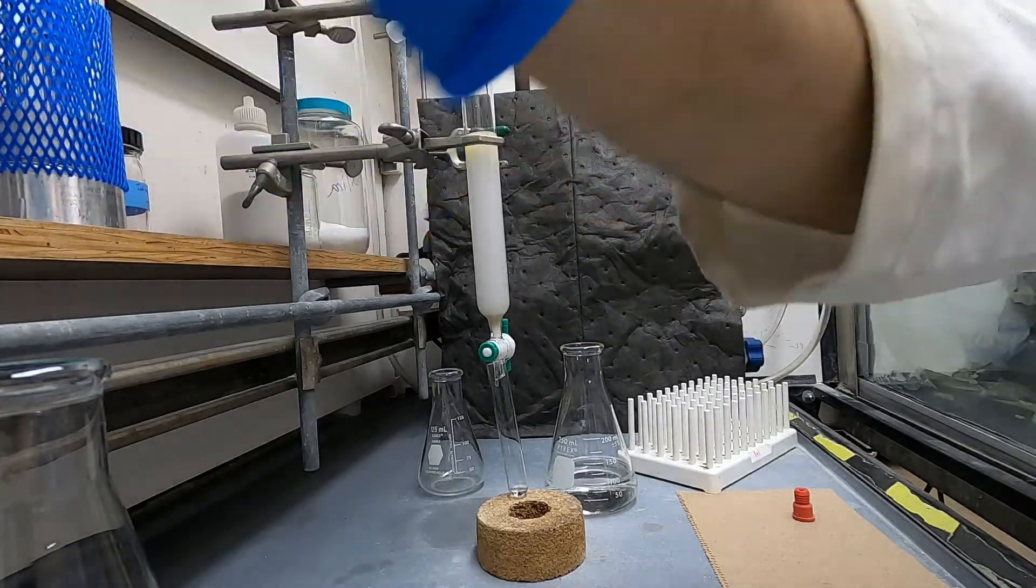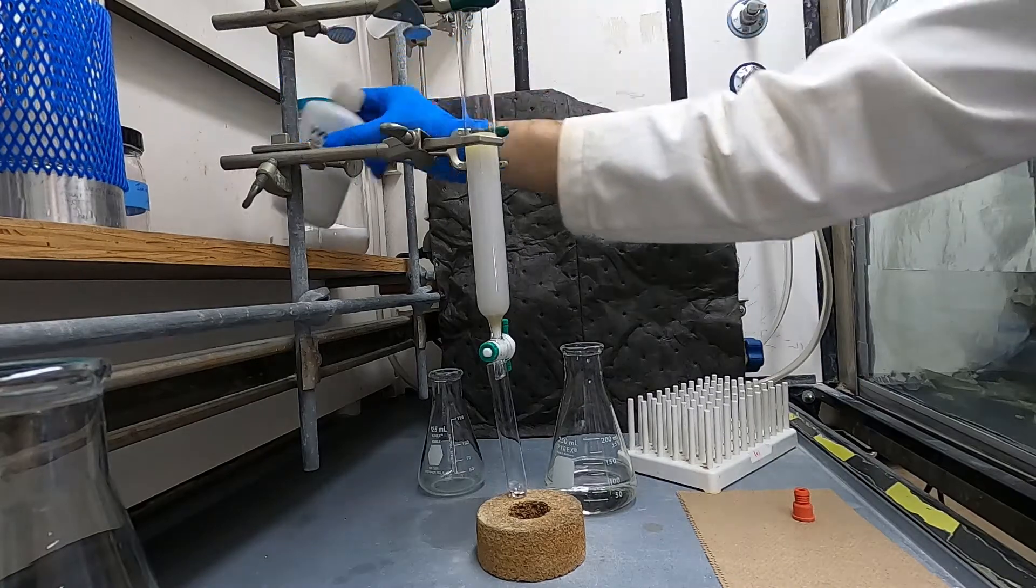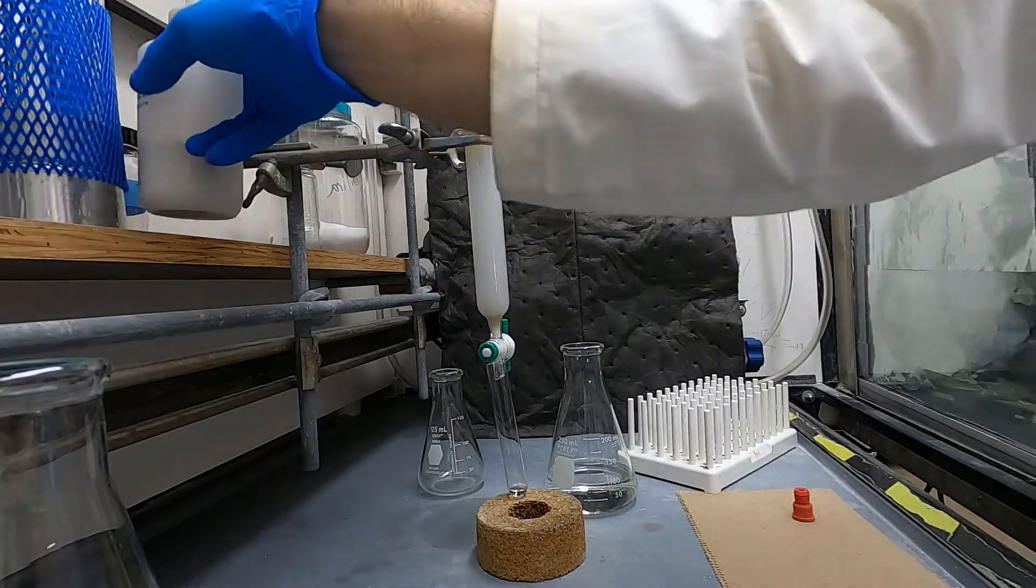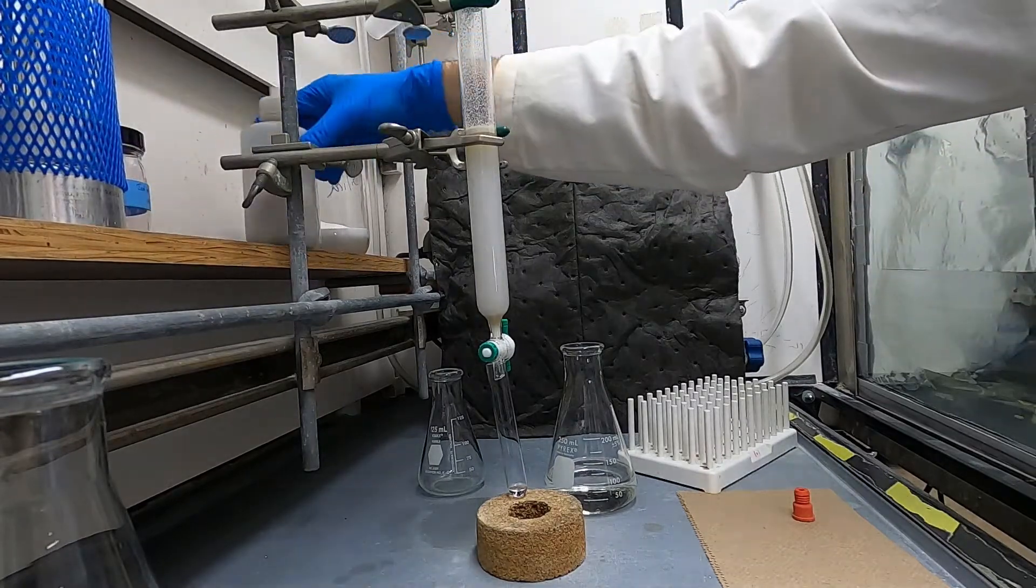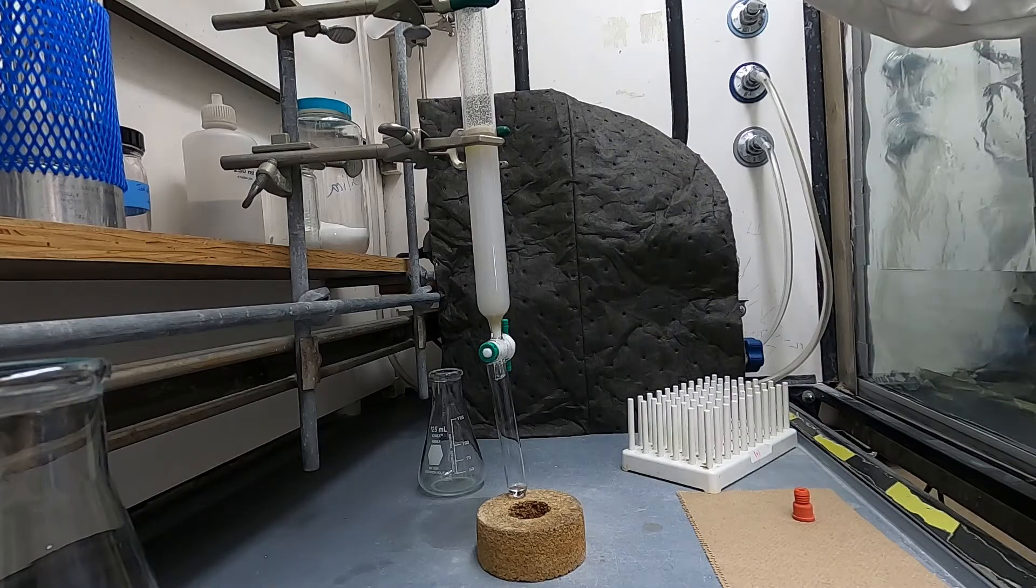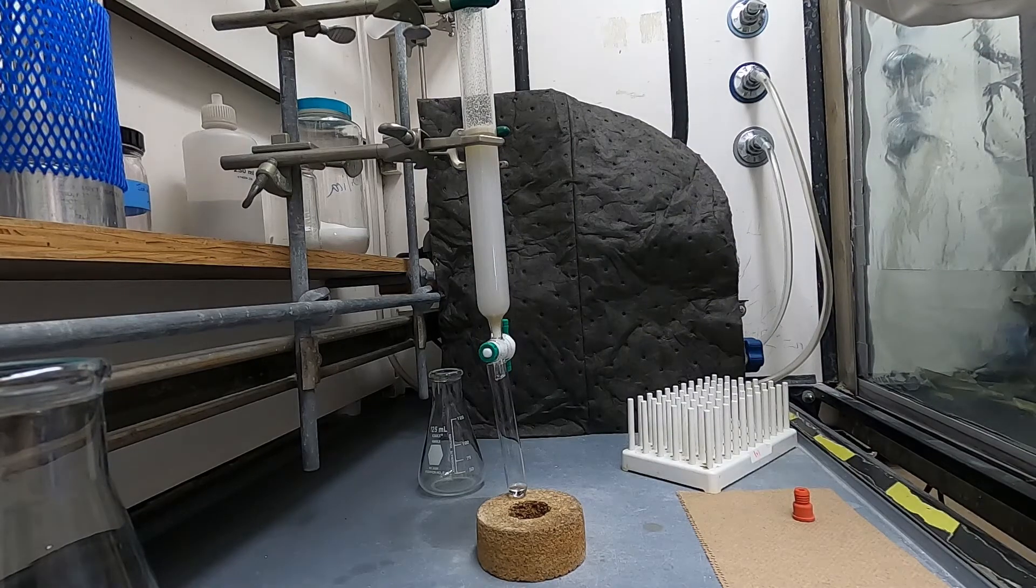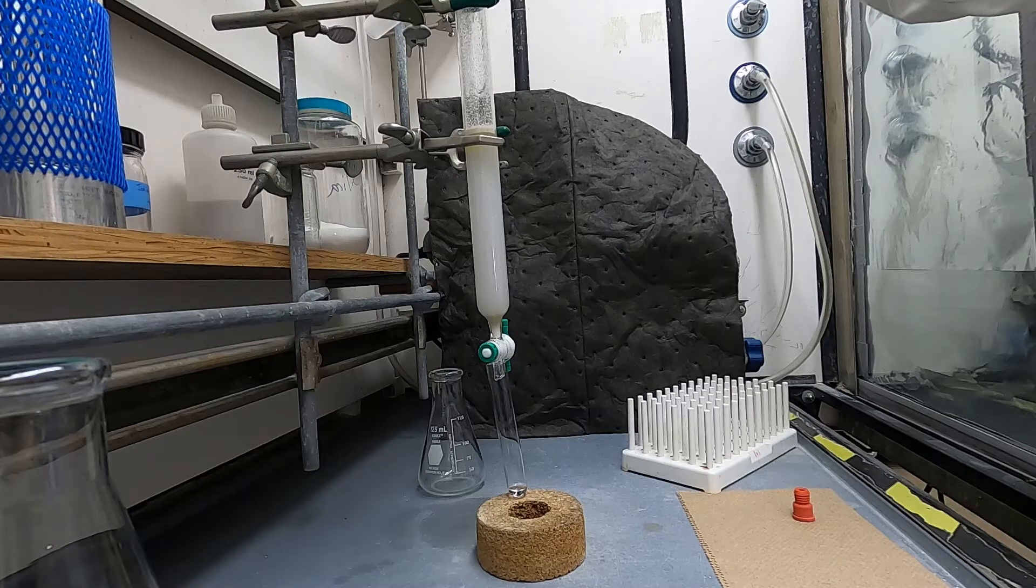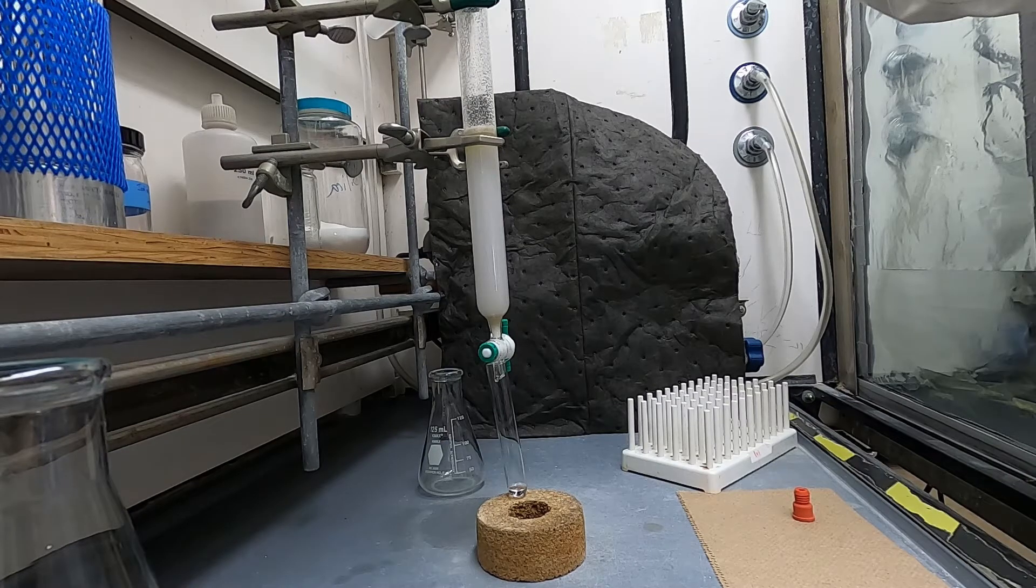Once it's at the surface of the silica I add another layer of sand. The amount of sand you add here doesn't really matter. I usually add a fair amount and then add more mobile phase to the top and here you want to do it slowly so that you can rinse down the sand but also you don't want to disturb the silica layer.